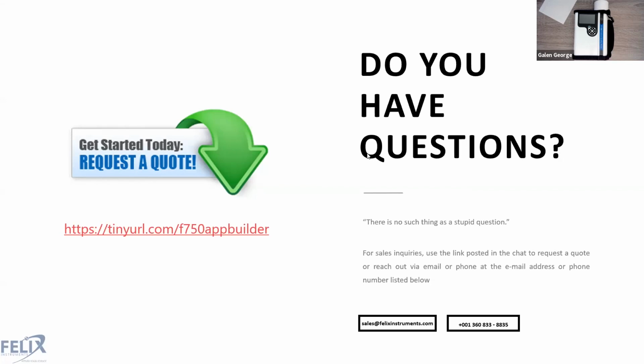The next question is from Carla. For the model that I suggested for the agave, I would actually maybe look into using the CI710S Spectra view. It's from our CID Bioscience side of the company.